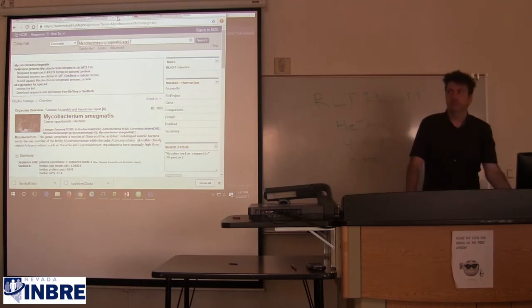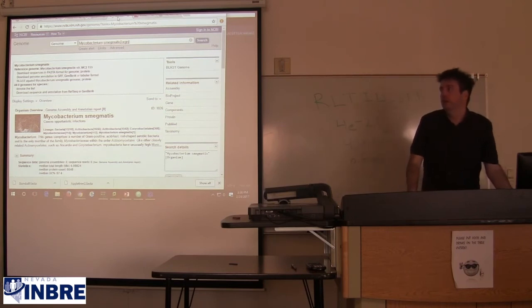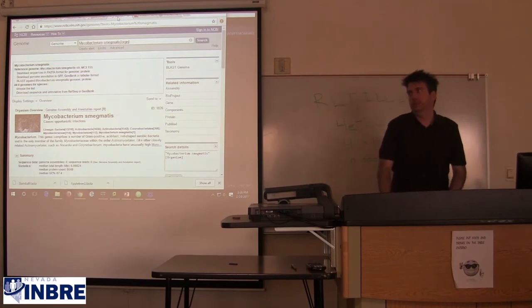Right. So in APE, under the tools, there's actually something that says blast sequence at NCBI. Is there any reason not to use that? It might be broken. If you scroll to the top of my notes, there was a note that the blast might be broken. I didn't actually check it. It's one guy in Utah who makes this. So his warning might not be true anymore.